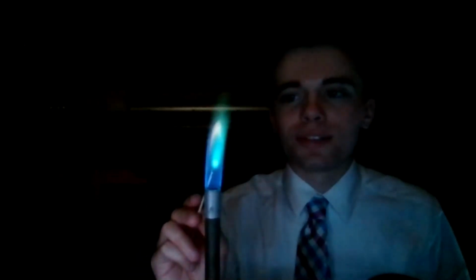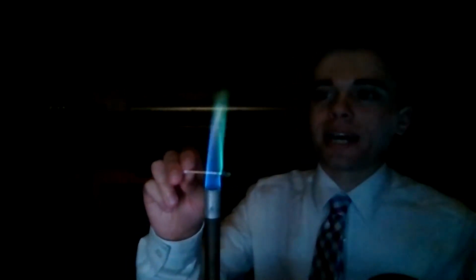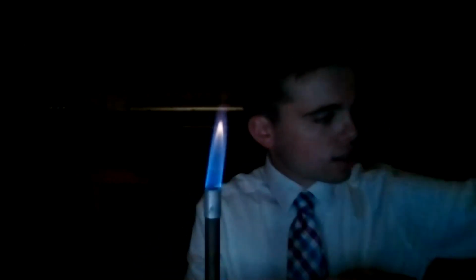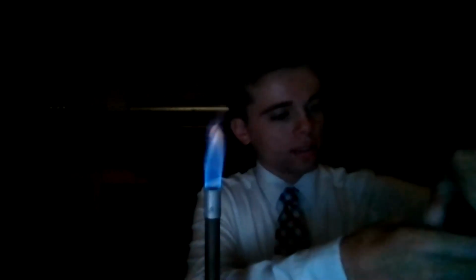We'll find a day to do the flame test lab over just to have some fun, because I think this is the best lab to do ever. Look at that. That's a nice green flame. And once again, it's only above from where it's burning. So if I put it in at the top, it's only at the top. But if I put it in all the way down to the bottom, the flame kind of shows up through the whole thing. Okay, so we're doing lithium next.